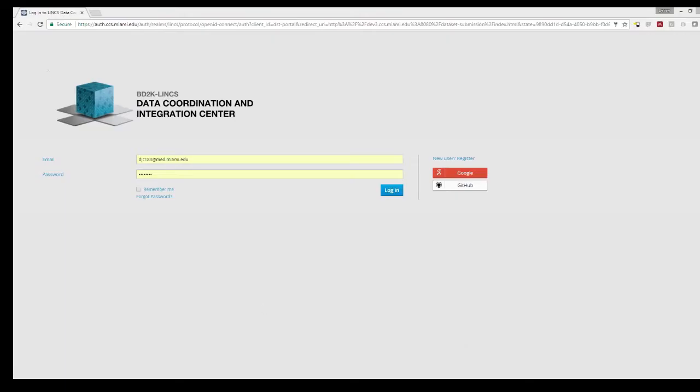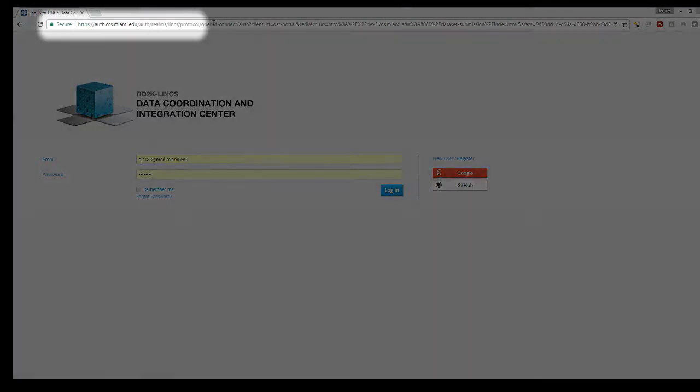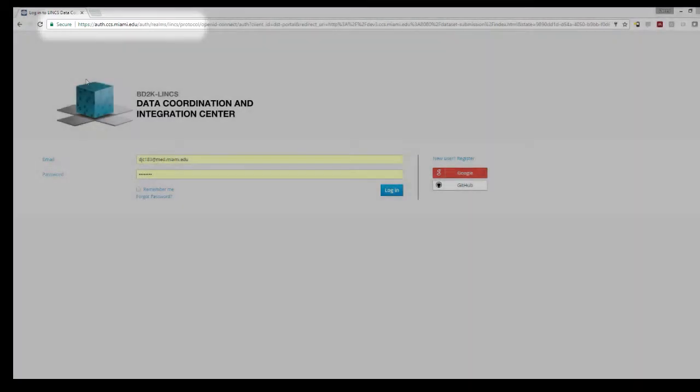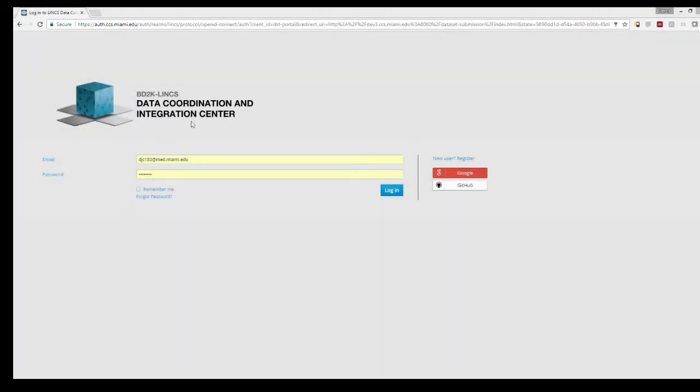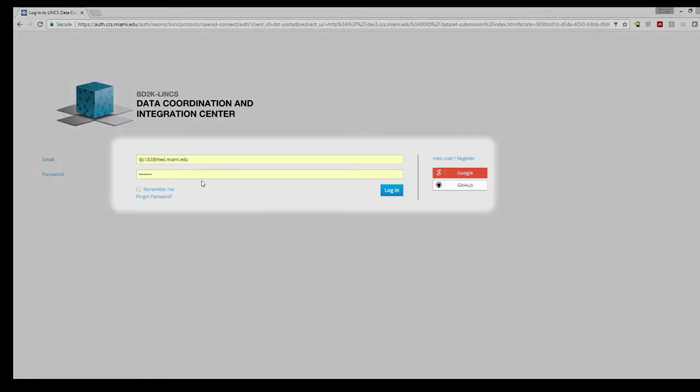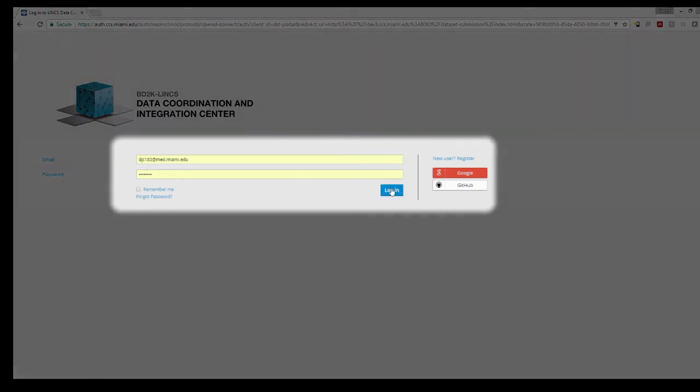Here we are at the LINCS DCIC data submission tool login page. You can see the address is a secure address and includes, among several other things, a single sign-on with Cedar through KeyCloak.